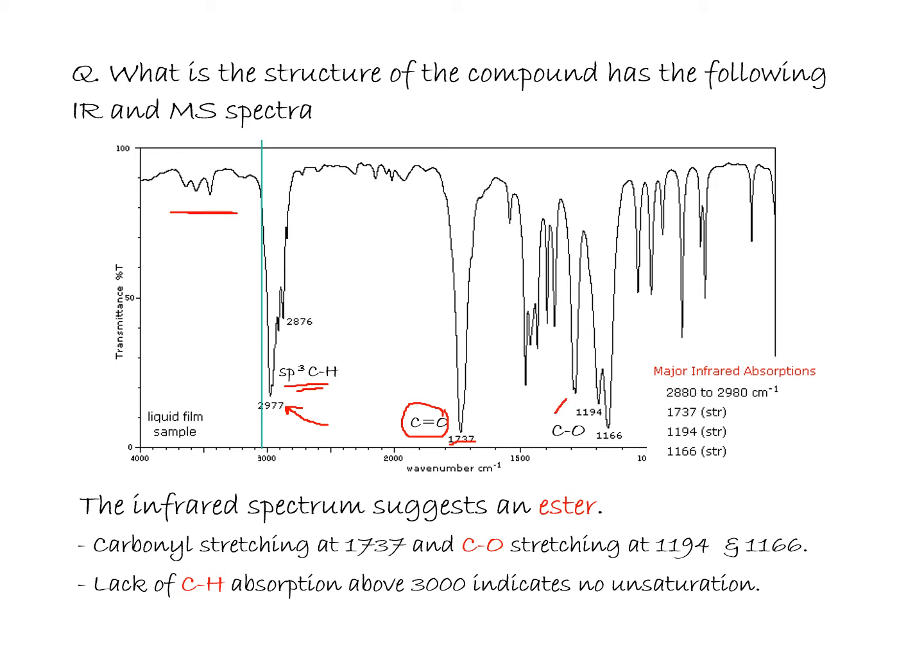We can see peaks here at 1194 and 1166 for C-O stretch.